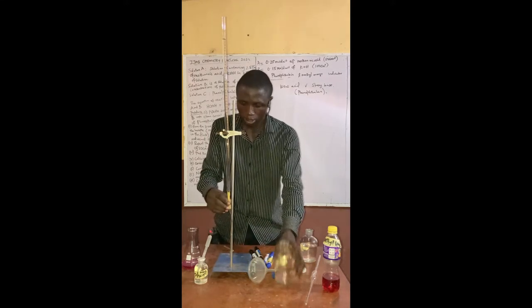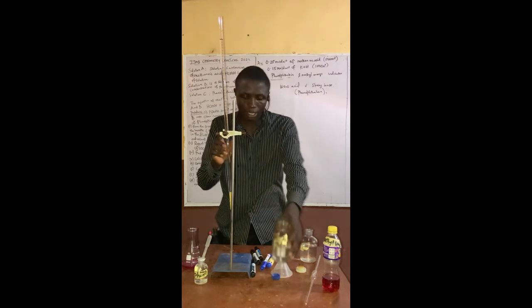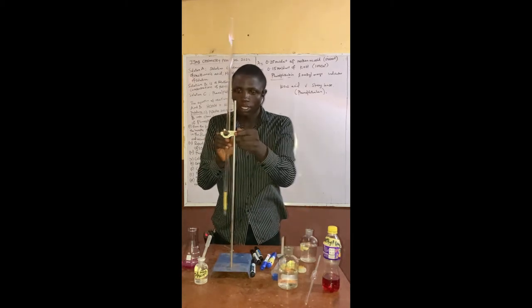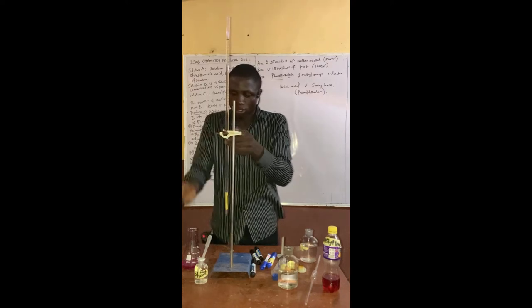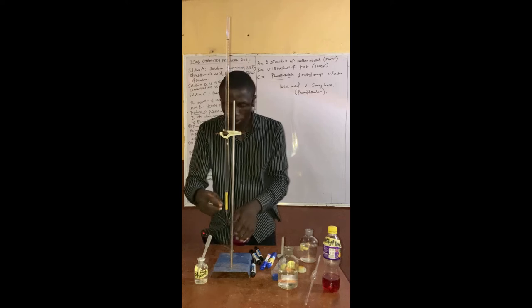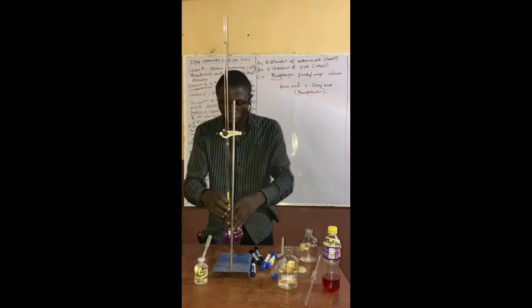You can just, so this is at 0 exactly now. So now let's release this one. Ensure that this is tightly closed and this is fair. So now let's release it now. And you shake thoroughly as you are doing it.